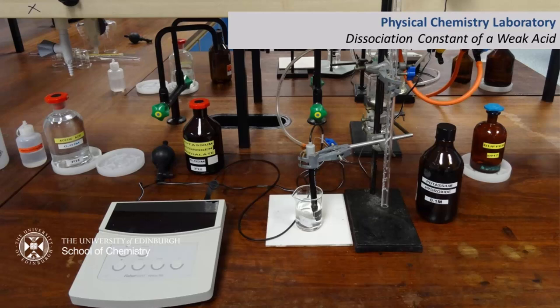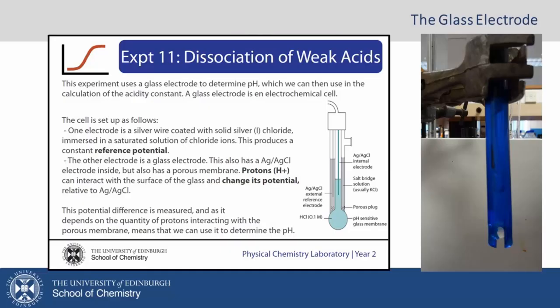Welcome to this experiment on the dissociation constant of a weak acid. In this experiment we are going to use the glass electrode. The glass electrode is essentially an electrochemical cell and it is set up as follows.